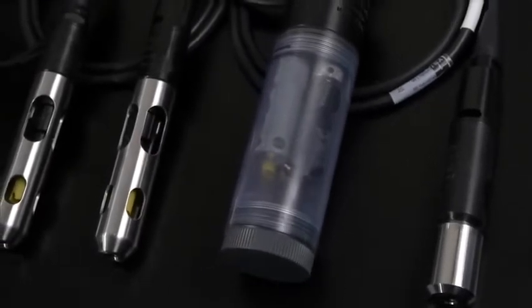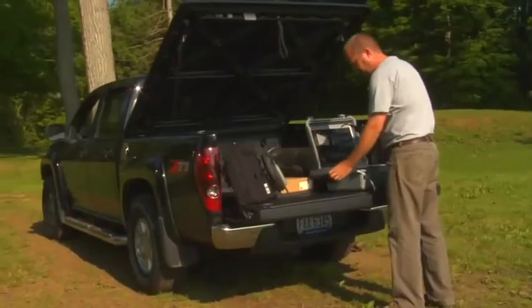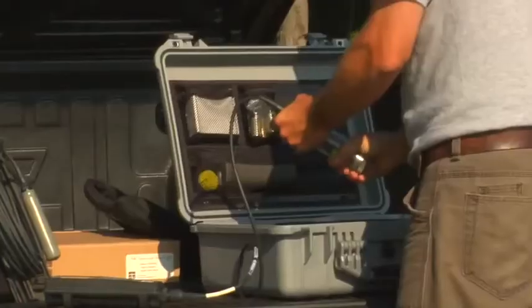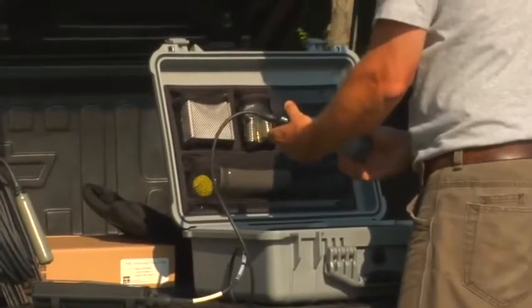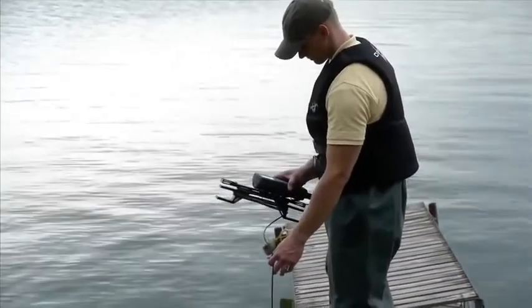Lab-grade ISE sensors and BOD probe available to make a true lab field instrument. The YSI ProPlus interchangeable sensors and extra-durable cables nearly eliminate downtime. And with its low cost of ownership, your initial investment will provide a great return for years to come.